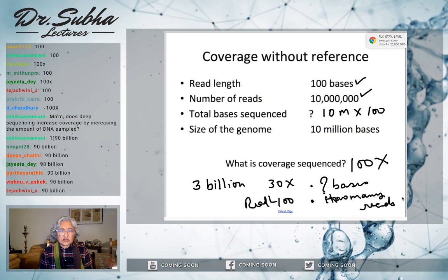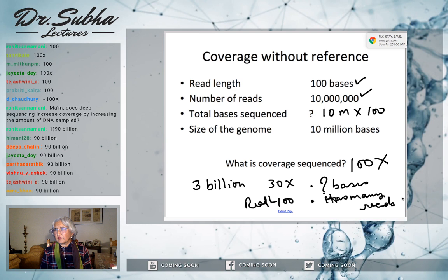So when you answer, say 2 comma 1 comma, because I asked you two questions. The first one, many are getting it right. I see the same set of people answering. That's not good because I want everyone to answer. Make an effort. If you don't get it, can you ask me a question? You just have to say, I'm not getting it, ma'am. So I will try to say it in a different way. I will give you some other example. So question number two: how many reads will be there in your FASTQ file if the read lengths are 100?